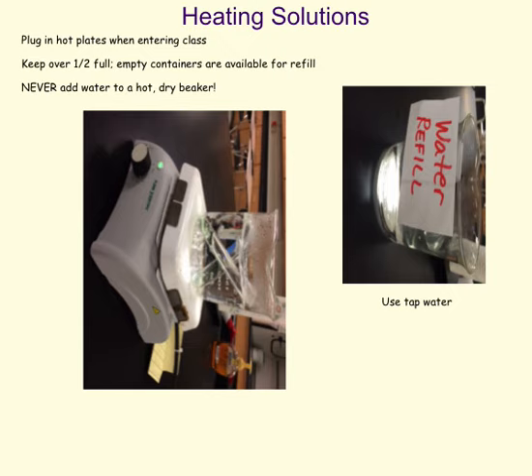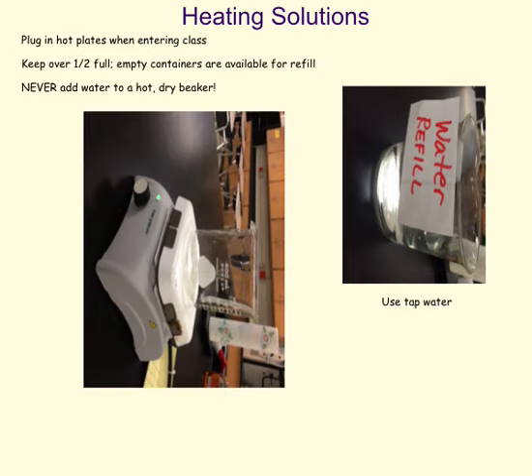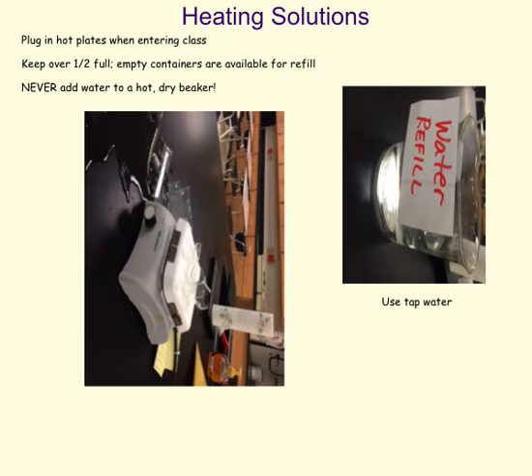Well, this starts to evaporate pretty quickly as that water boils. So then we have it suddenly going dry, right? Well, if you try and add water to a hot, dry beaker, it's just going to break. So make sure that you never add water to a hot, dry beaker. Instead, you're going to have some refill water that's going to be available to you. And by refill water, it's just tap water. So you're going to have a container that's available for you, and you can just fill it up with tap water and add to it as needed. But you should never let a hot water bath beaker get less than halfway full. So you should always keep it with water in there.